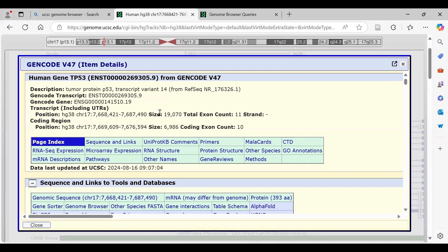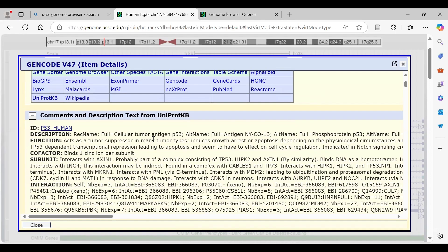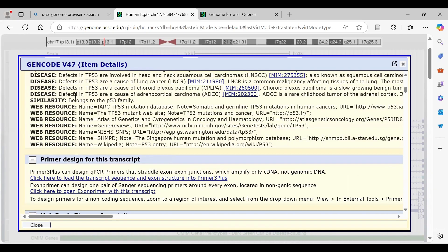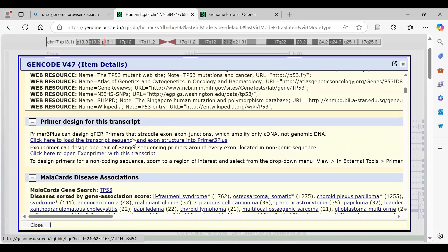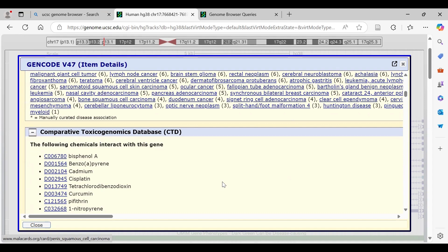Clicking on TP53 gives different types of detailed information: description, transcript, position, number of exons, which strand it is on, and links to sequences and tools. The genomic sequence, mRNA sequence, and protein AlphaFold structures are available. UniProt KB information includes cellular locations, domains, disease associations, web resources, primers designed for the transcript, and MalaCard gene-disease associations.